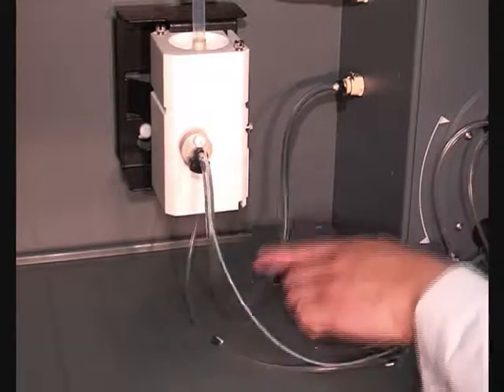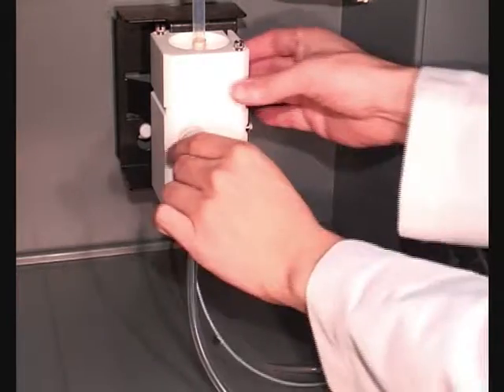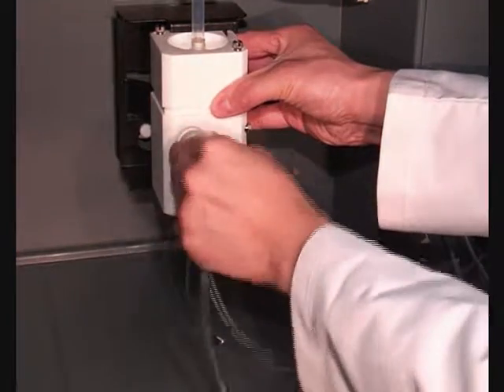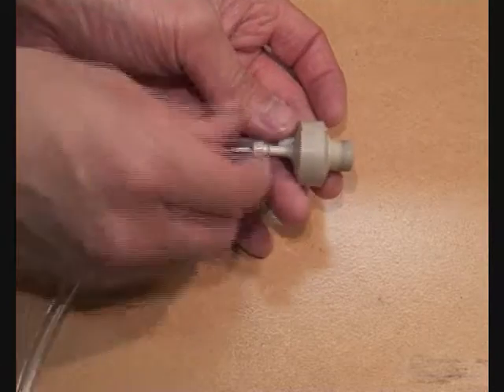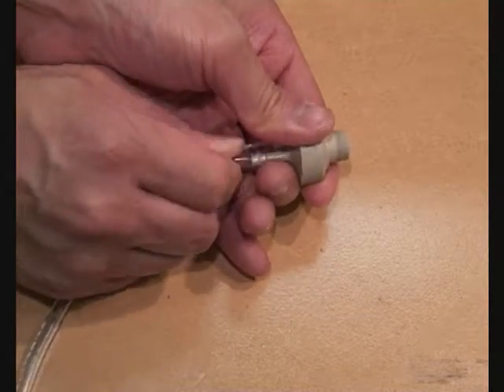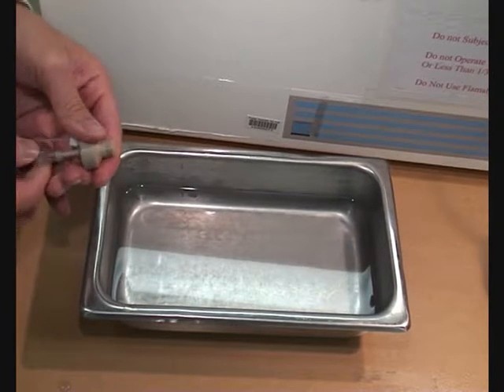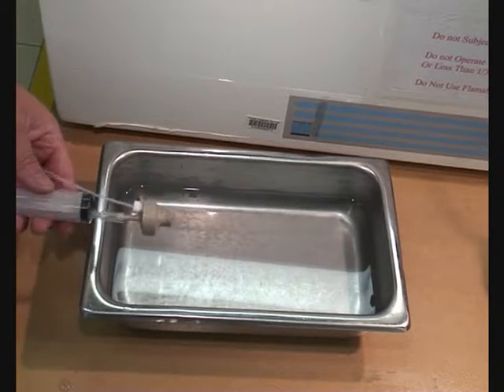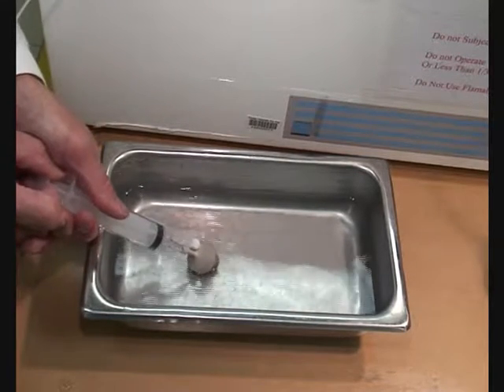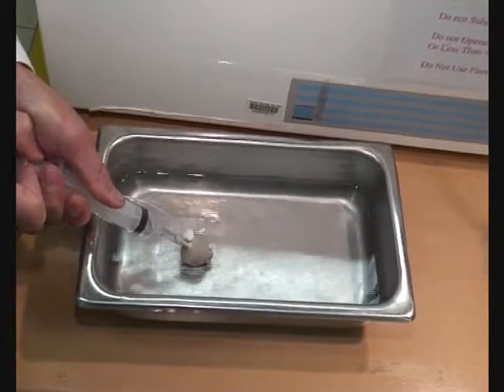Remove the v-groove nebuliser from the spray chamber and remove the gas inlet tubing. Using a syringe, draw water or rinse solution through the nebuliser in the reverse direction to normal flow. Do this by placing the tip of the nebuliser in the solution and applying a vacuum to the gas inlet end.